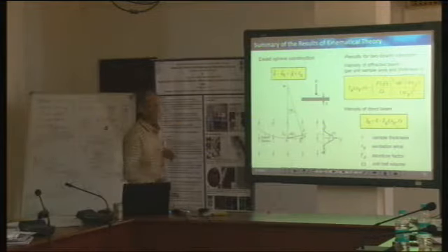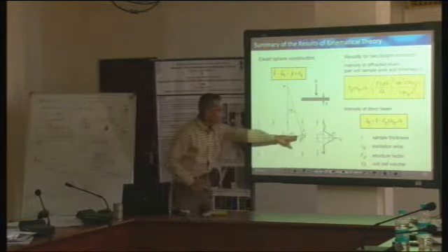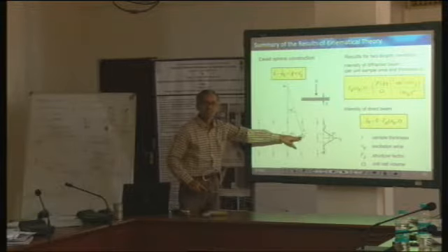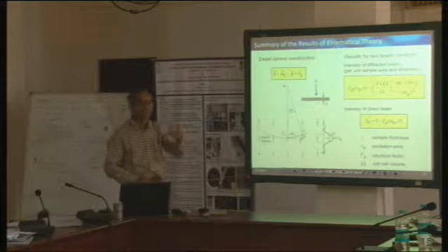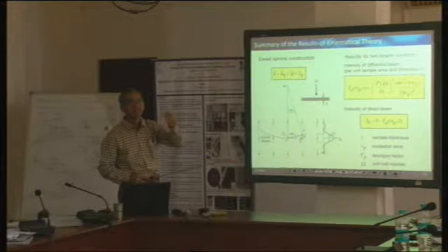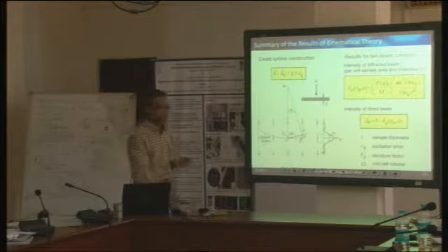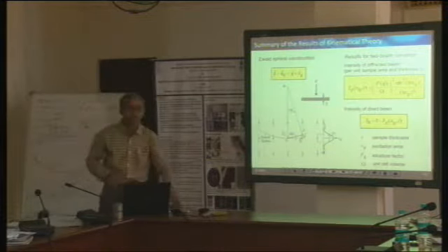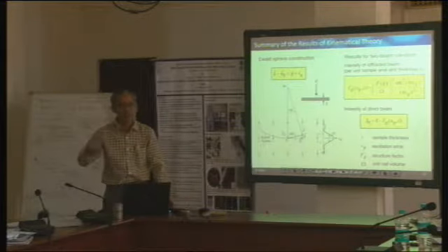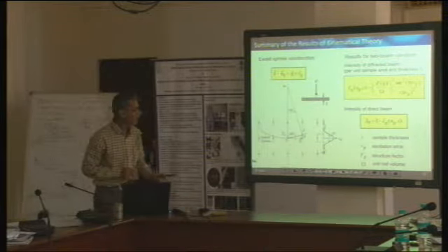What is probably not so clear is that even when the Bragg diffraction condition is not satisfied, we still get diffraction. And we get it because of this relaxation of the Bragg diffraction condition. Okay, good. Now this point is going to be relevant to understand our further images, so please pay attention.